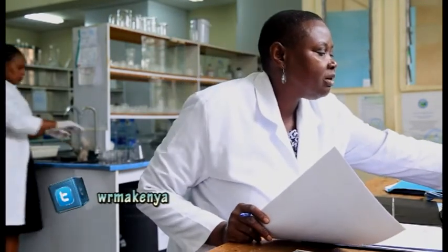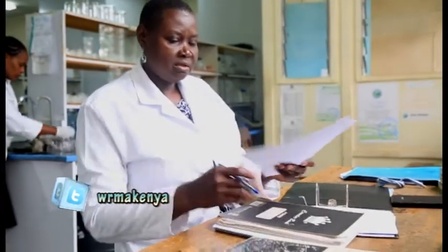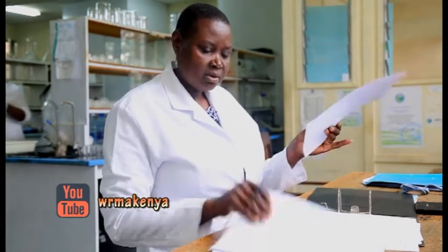Once we are through with the recording into the forms, we have a release book. We enter all the numbers in our release book, having so many which have been entered here, ready for releasing.